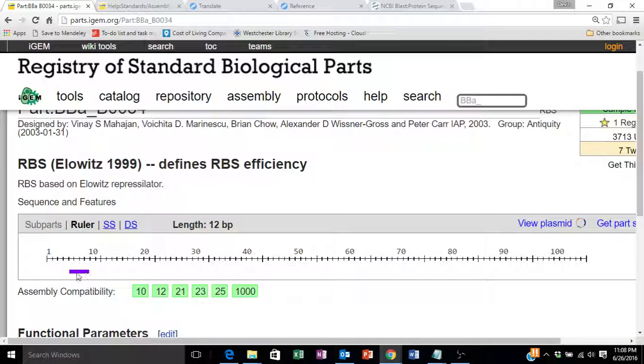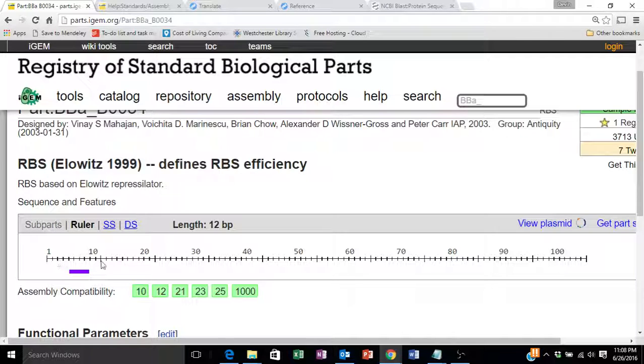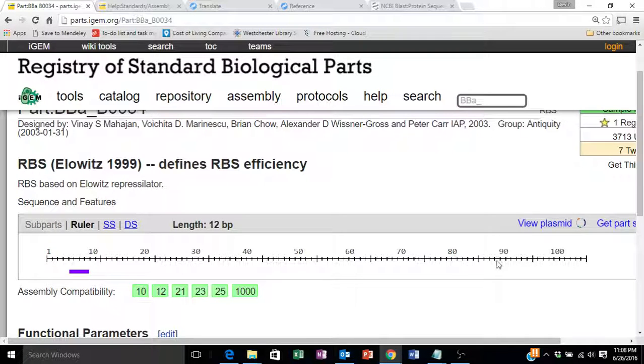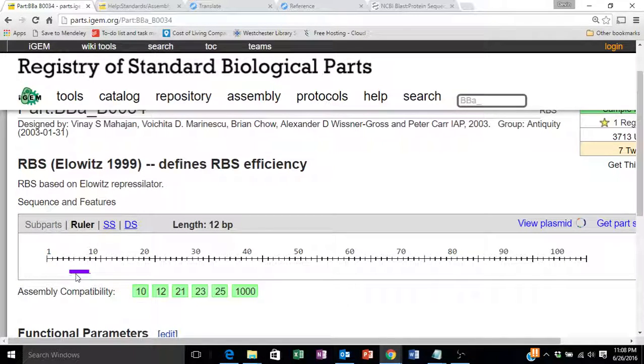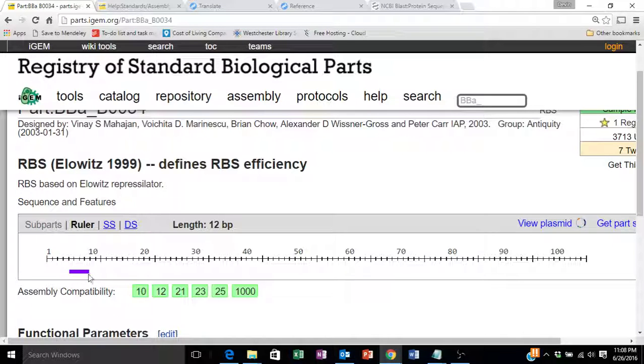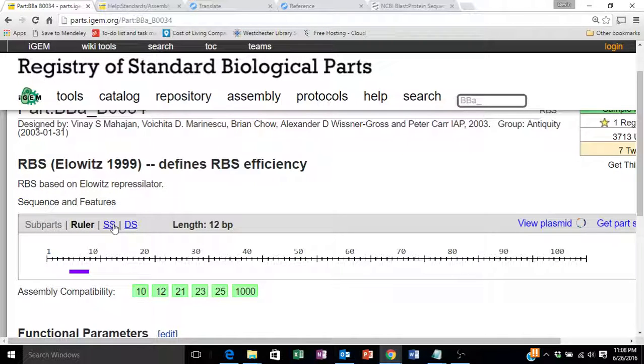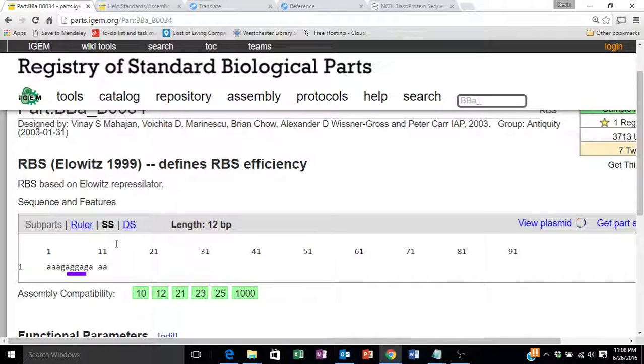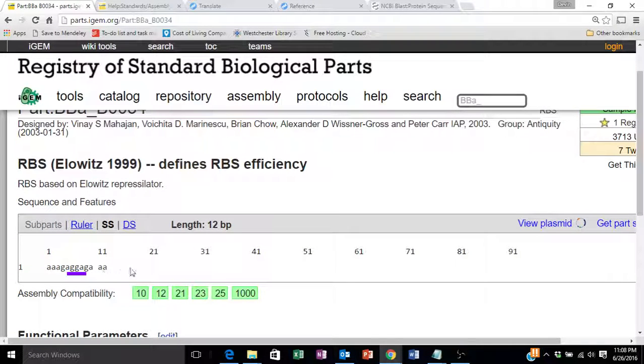So there's a ruler view, counting 1 to over 100 nucleotides. This particular part is quite small, so you only see a small bar depicted here. We can also view the single-stranded DNA sequence for this part.